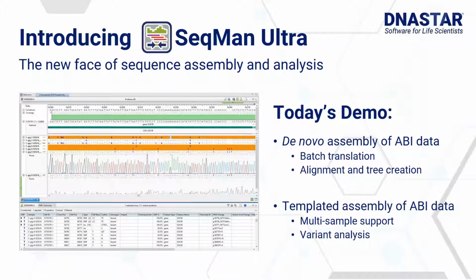So for today's demo, Eric's going to show a de novo assembly project with ABI Sanger data, and including some downstream analysis options for translation, alignment, and tree creation. Then he's going to show you a templated workflow, including this new multiple sample support, as well as variant analysis.